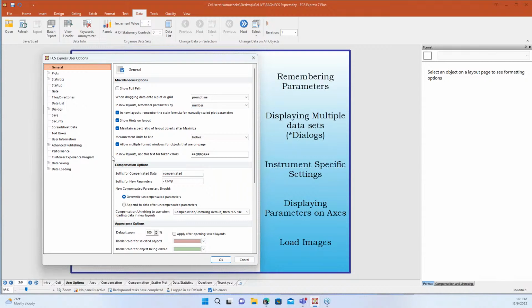So usually this comes up, we don't get a lot of questions where people are asking us, like, how does FCS Express remember parameters? It's always like, I have this layout and I've tried to load some data and now it looks crazy. Or like my axes don't look right and it doesn't load properly. Like, what does that mean?